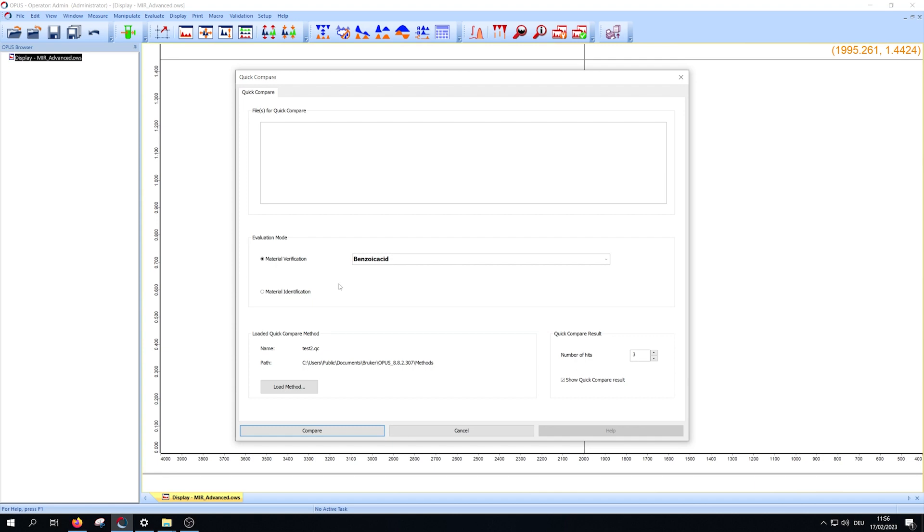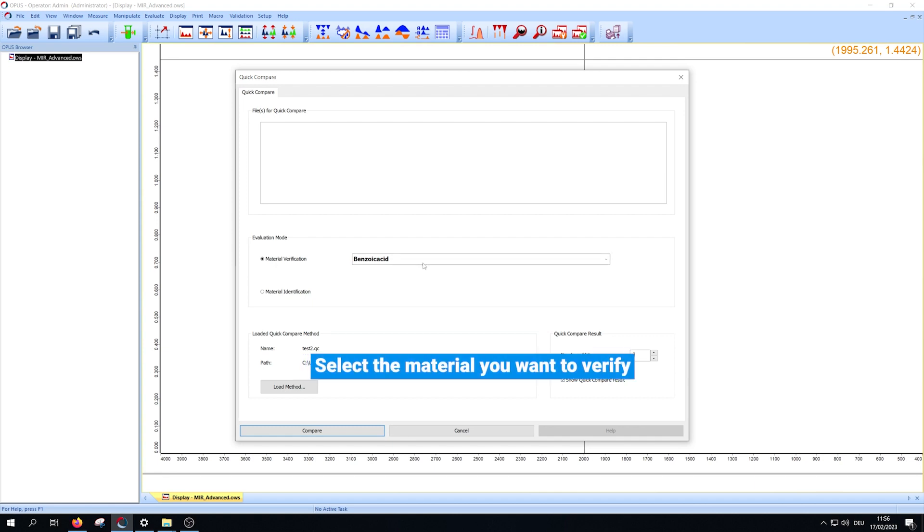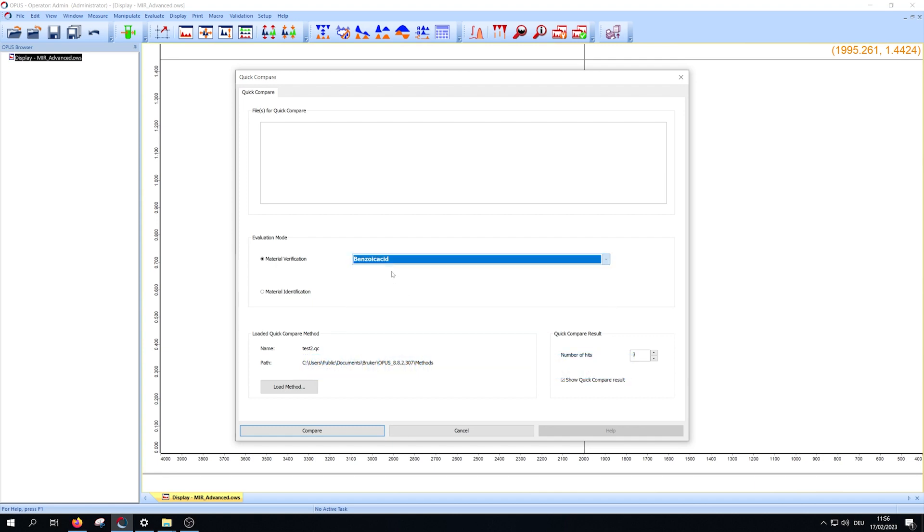If you want to verify a material, you have to select the expected one. Afterwards, just pull the spectrum you want to compare into the rectangle and press compare.